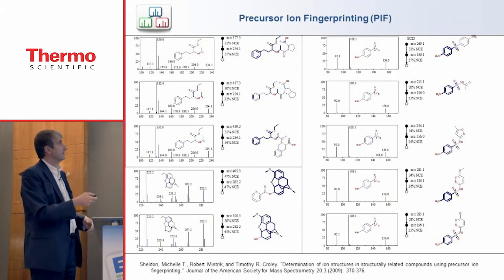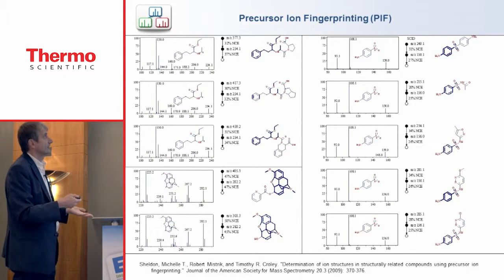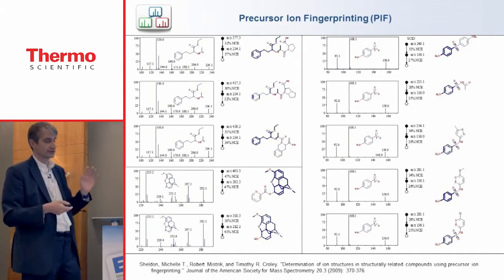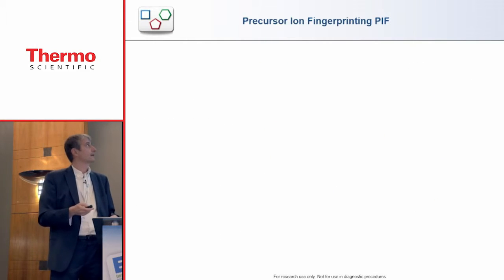So, this slide actually shows that it really works. Here we have different compounds that yield the same fragments, and we have matching spectra. Another example, and another example. It works well for positive and negative electrospray.